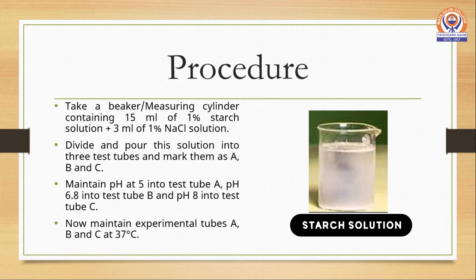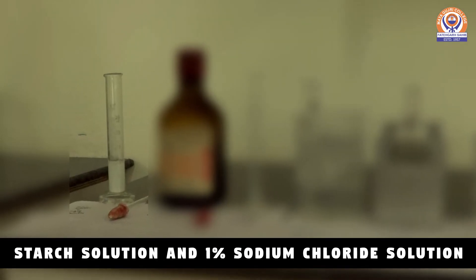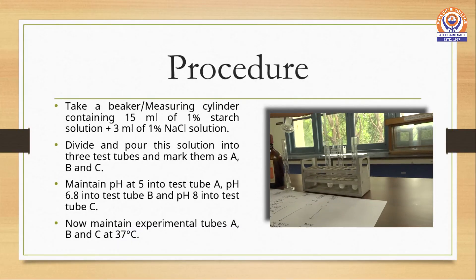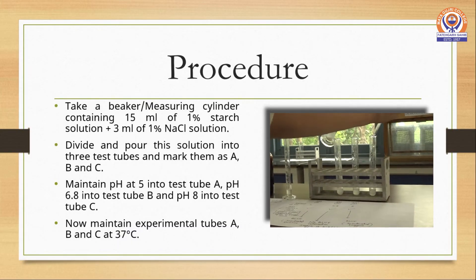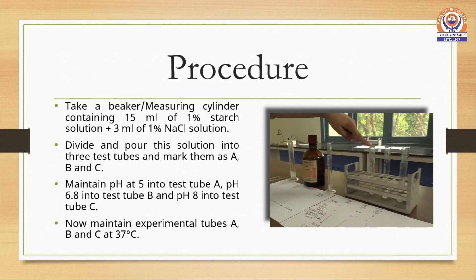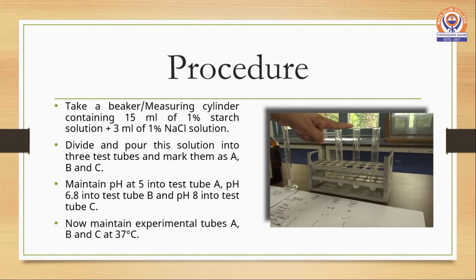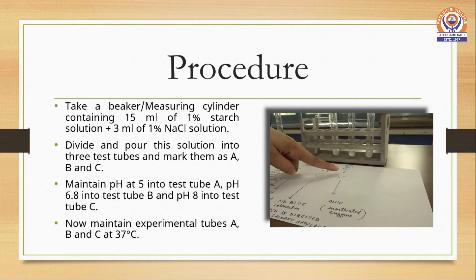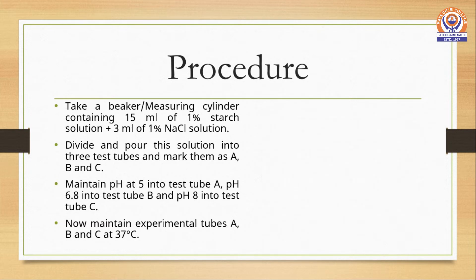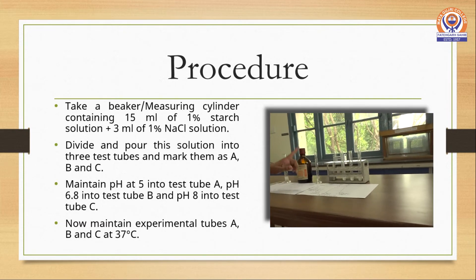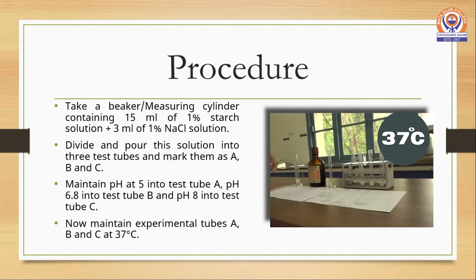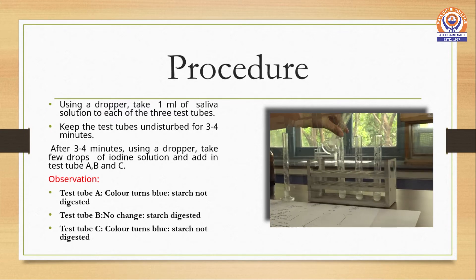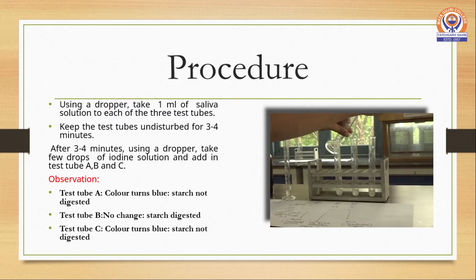Now take a beaker or a measuring cylinder containing starch solution and sodium chloride solution, and pour this into test tubes A, B and C. Test tube A is maintained at a pH of 5, test tube B is maintained at the pH of 6.8, while test tube C is maintained at the pH of 8. All these test tubes are maintained at the temperature 37 degrees Celsius or room temperature. Now using a dropper, take 1 ml of saliva solution and add it to all three test tubes A, B and C.